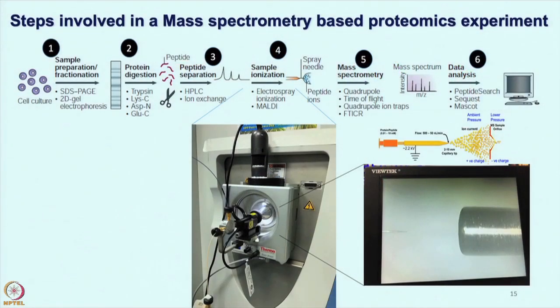Now, you are familiar with liquid chromatography and how nano LC can be used, how different parameters and different pumps are important, and that keeping a watch on the pressure is very crucial. Now, you are ready for injection with electrospray ionization. This is a very crucial part, because now all your peptides have been converted to gaseous ionized forms and they have to move inside the mass analyzer for further analysis.